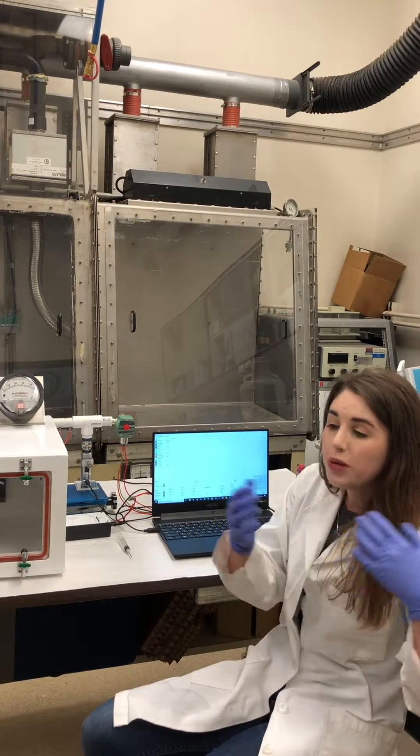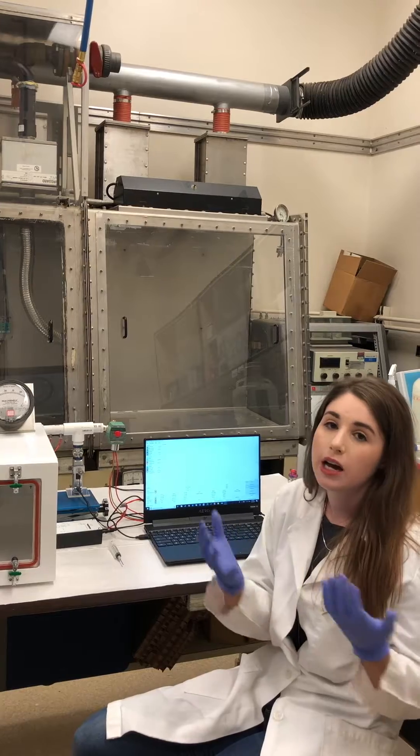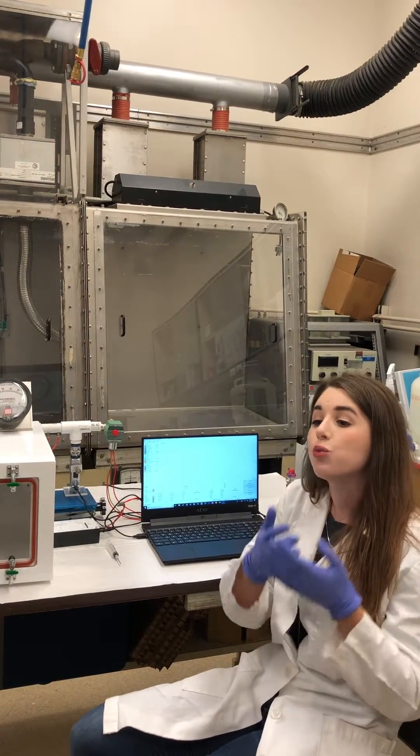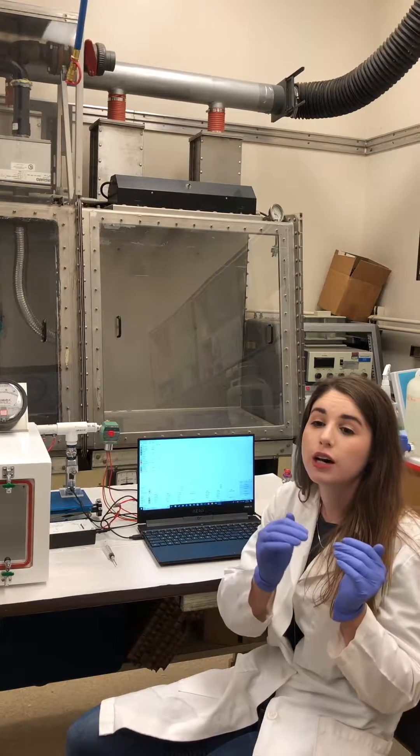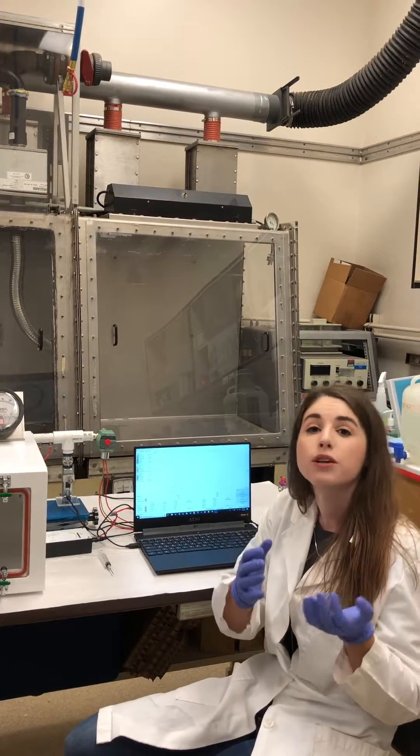We are looking at the chemical composition of the vapor. We want to see how that chemical composition possibly changes at different temperatures and with different ratios of propylene glycol and vegetable glycerin and the amount of nicotine you put in a solution.